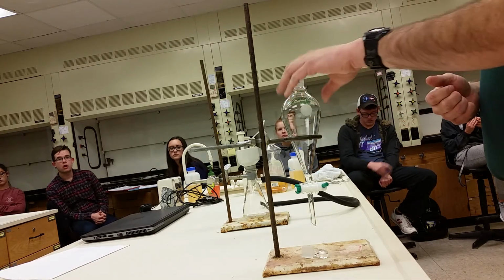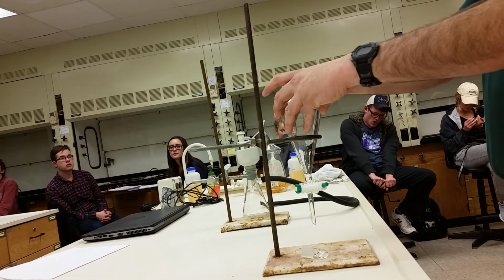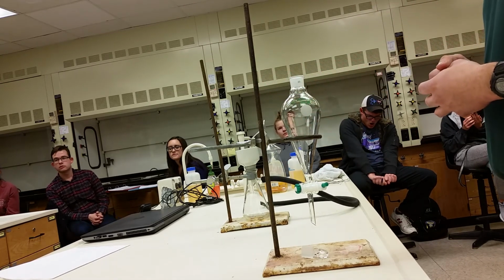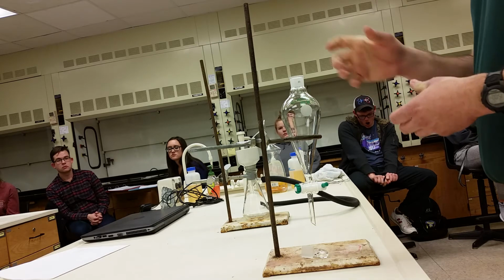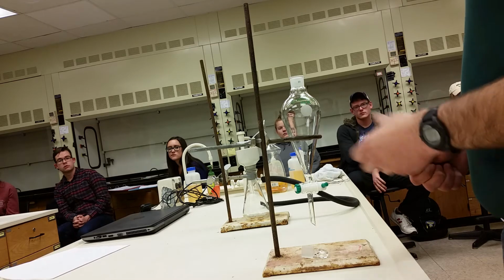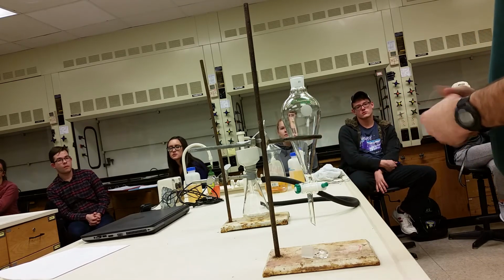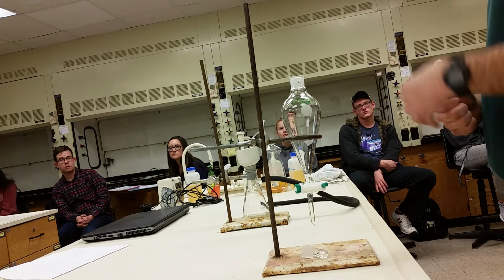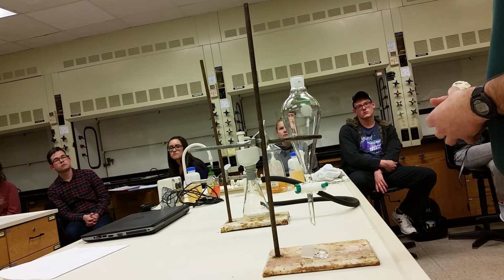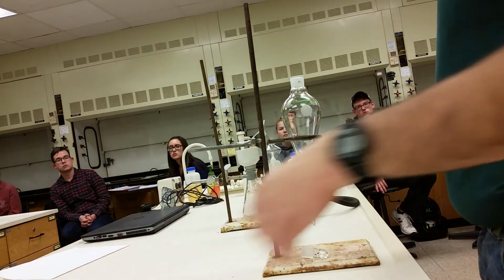Okay, so once you've done shaking, put the separatory funnel back into the ring stand. Take the lid off of it, let the layers separate, drain out the bottom layer into the beaker. Sorry, the Erlenmeyer flask that says bicarbonate. Repeat again. Once you've done that 3 times, take the flask, put it off to the side.